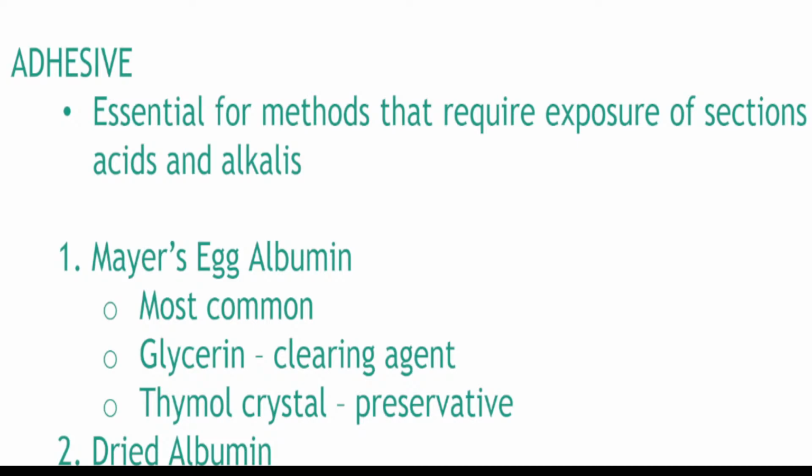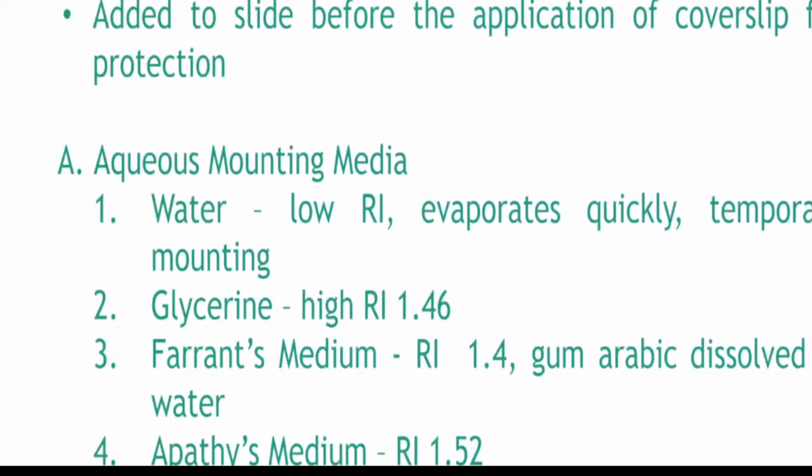Thymol crystal is the preservative. Para siyang amoy menthol, yung thymol na yan. Okay? Napakaluma na niyan. Nakalagay na yan doon sa museum namin doon sa dati kong school sa Pilipinas. Naka-museum na yung mga yan ngayon. Alright? Ito yung important sa ating lahat, class.